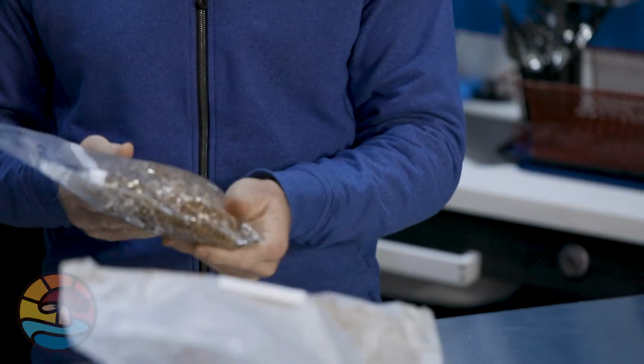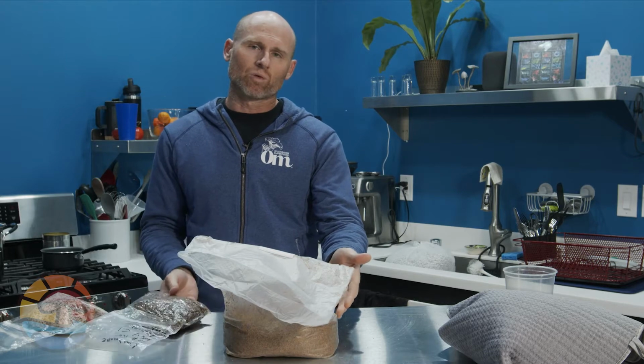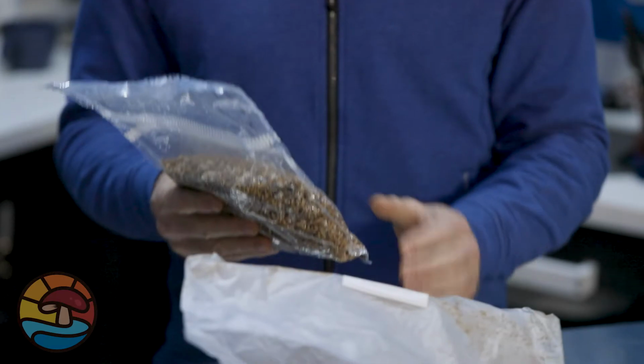The idea here is that we propagate mycelium on the grains. And then when we break them up, they disperse into the substrate to the point where they can grow and attach to each other very quickly. If we were to take one piece of grain and stick it in there, it would take a long time for it to grow all the way through the bag. And that's how it happens in nature. You get one spore that germinates, meets up with another spore, and it takes a long time, almost 6 months to colonize a substrate. So what we're trying to do is speed that up.